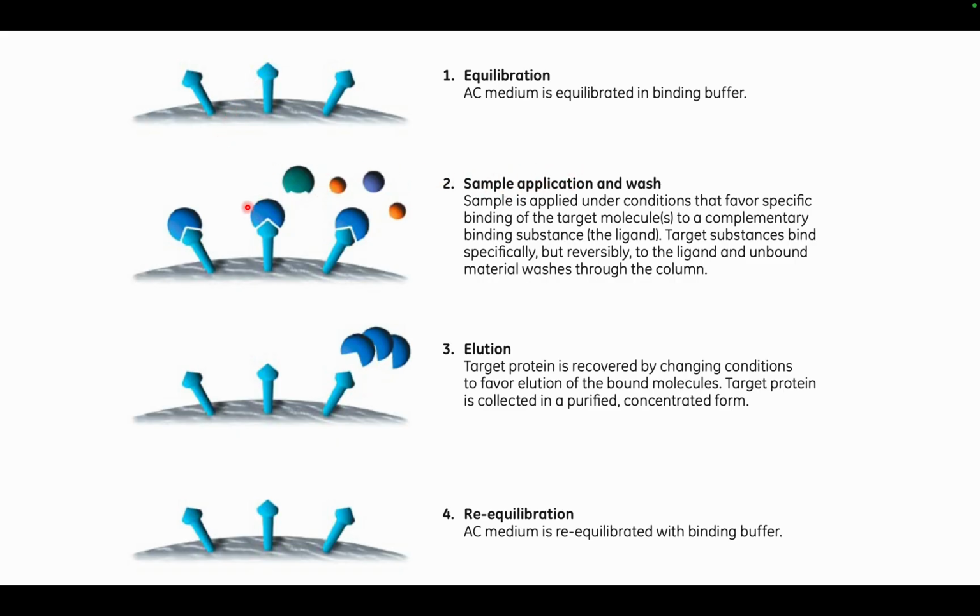That means that we will put our mixture of proteins in the column, and wherever the complementary binding site is there, that protein will be able to bind to the column, right? Obviously, we have to do this in a condition that is favoring the binding. So maybe we won't use very extreme conditions at this stage. So we should choose some condition where our protein is stable and this binding interaction is strong.